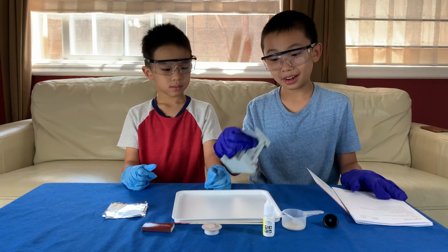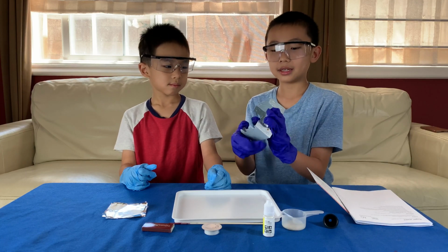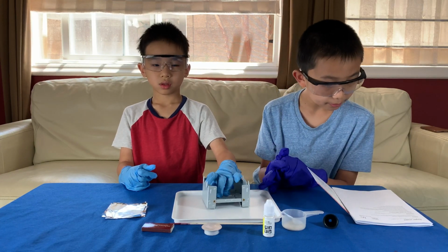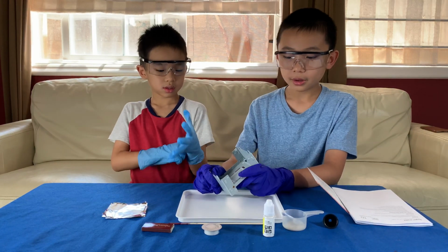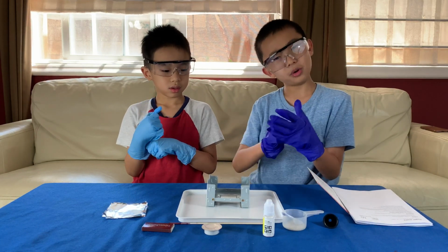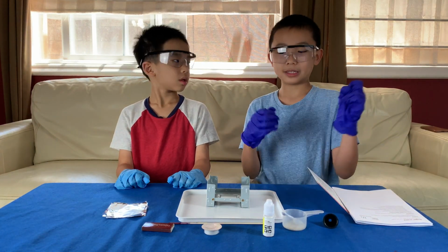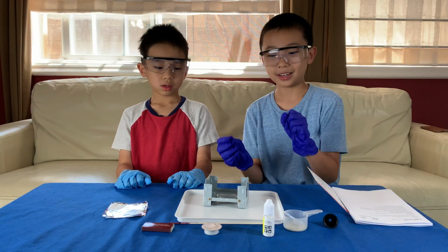Oh yeah, and I forgot. We also have a small stove, which we applied a thermo sticker to. And what that does is it might glow or light up if the stove is hot. So that's like a warning to us when it is hot. And then when it's not hot anymore, it won't glow. So that's a very nice thing they provided us.